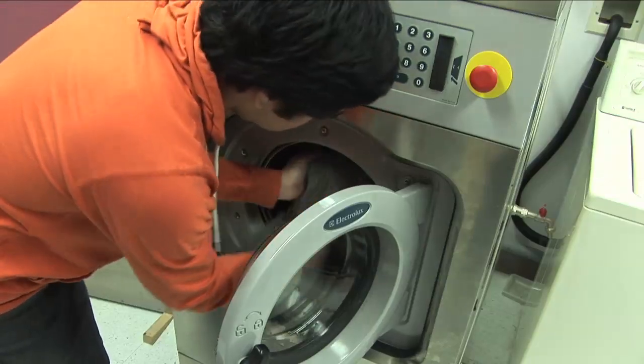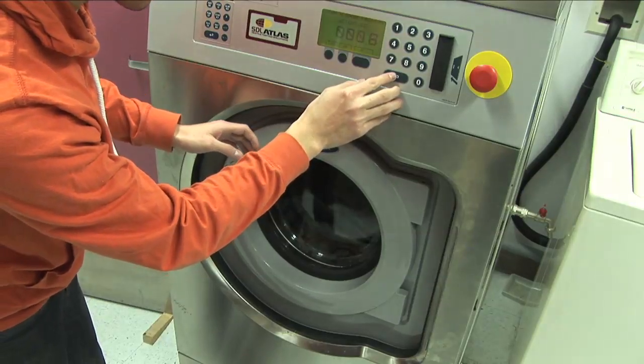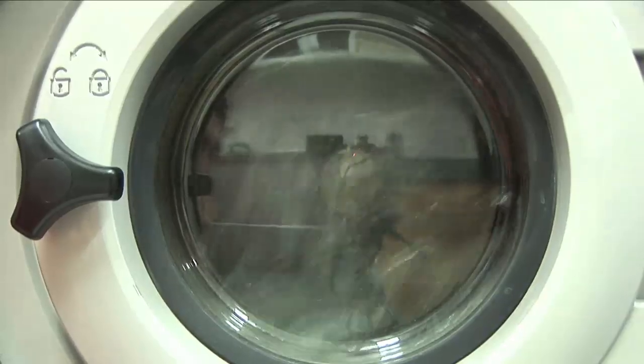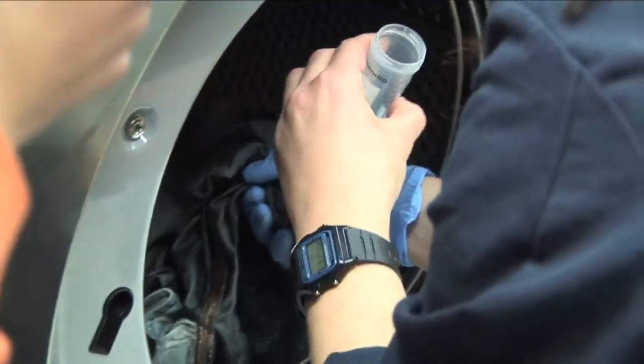Now we're going to wash them, and when we wash them in the washing machine we're going to take some of that wash water after about three minutes or so, to see how much bacteria has actually come out — how much was in these jeans and how much we've got out into the washing liquor.